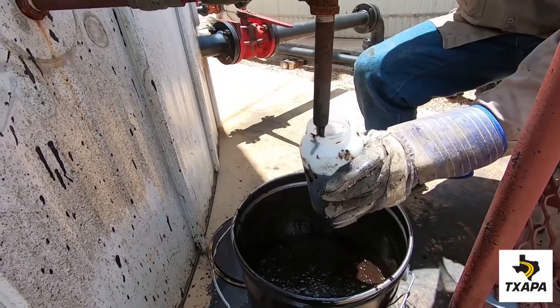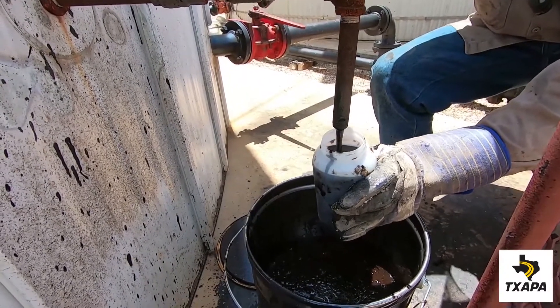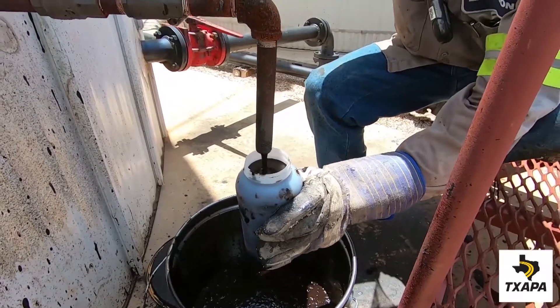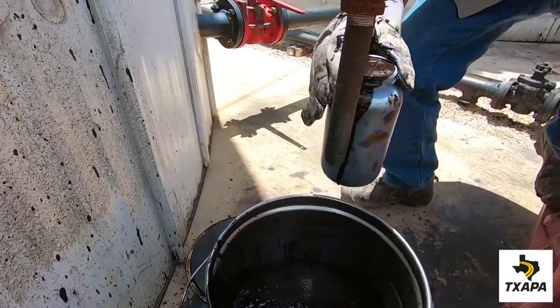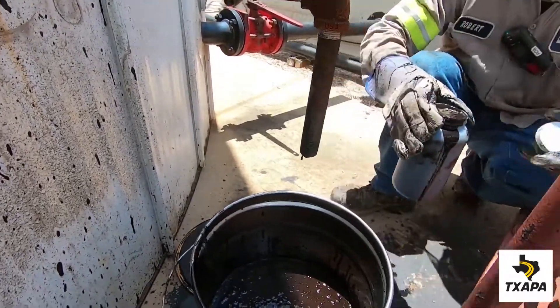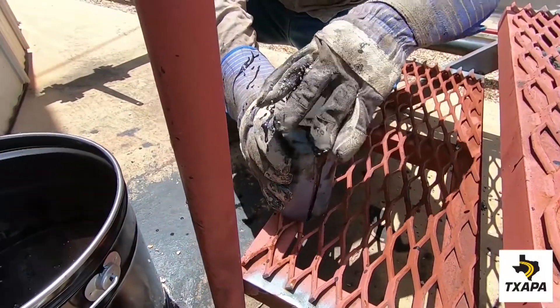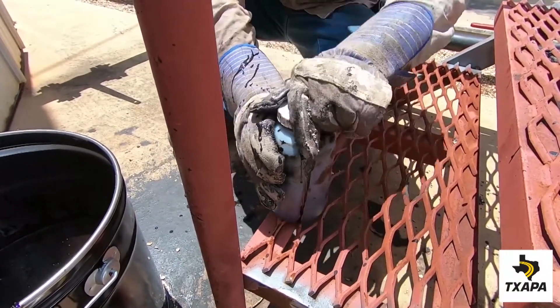Remember to fill the container to the top. You don't want any air in the sample once the lid is placed on tightly. Place the lid on the container, squeeze the side of the container slightly to raise the level of emulsion to the top to remove any air gap, and screw on tightly.